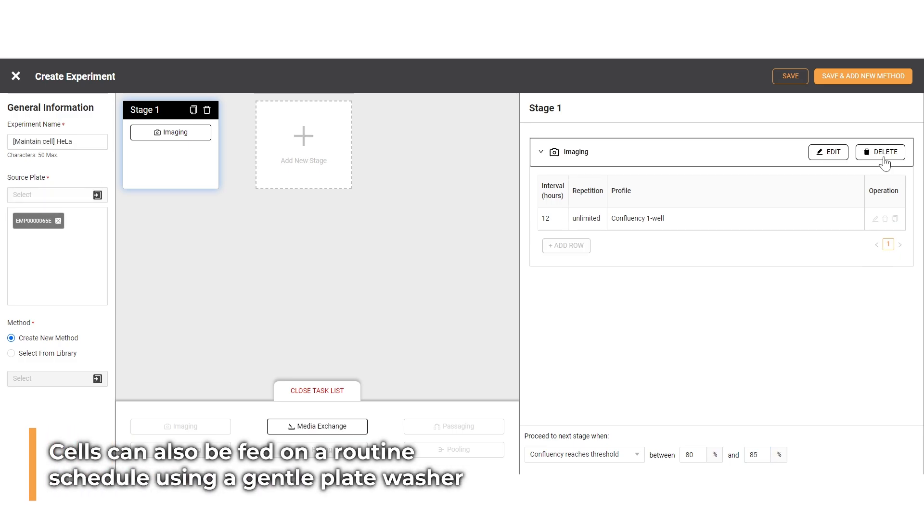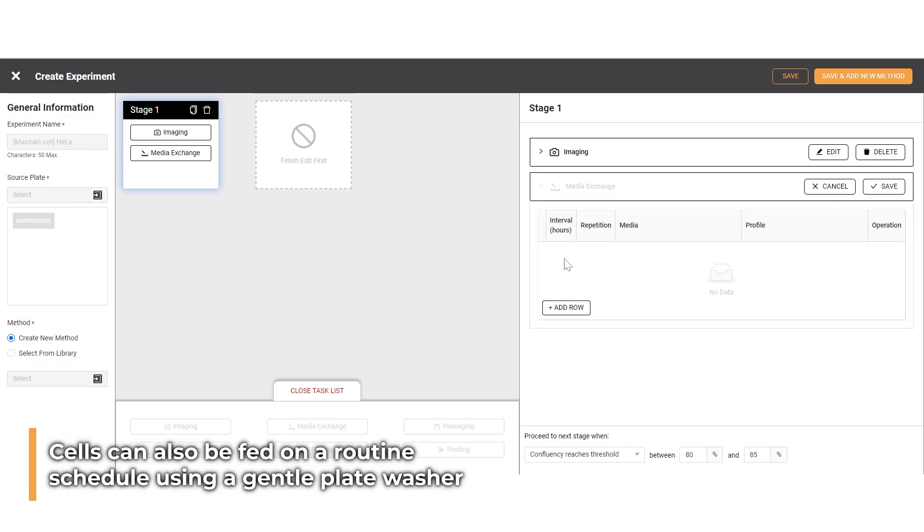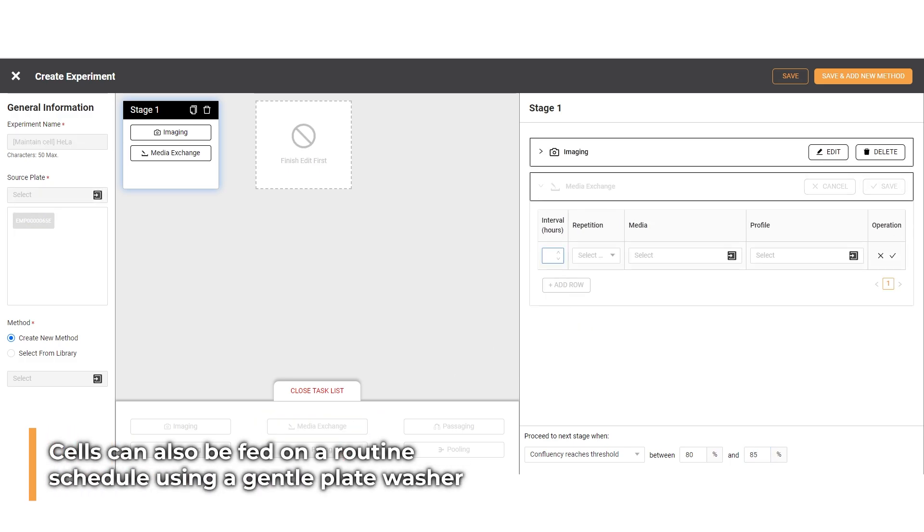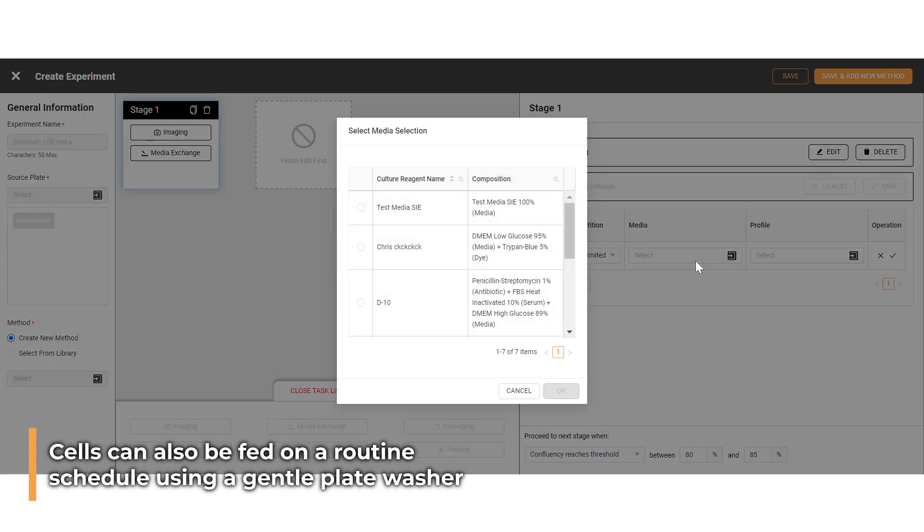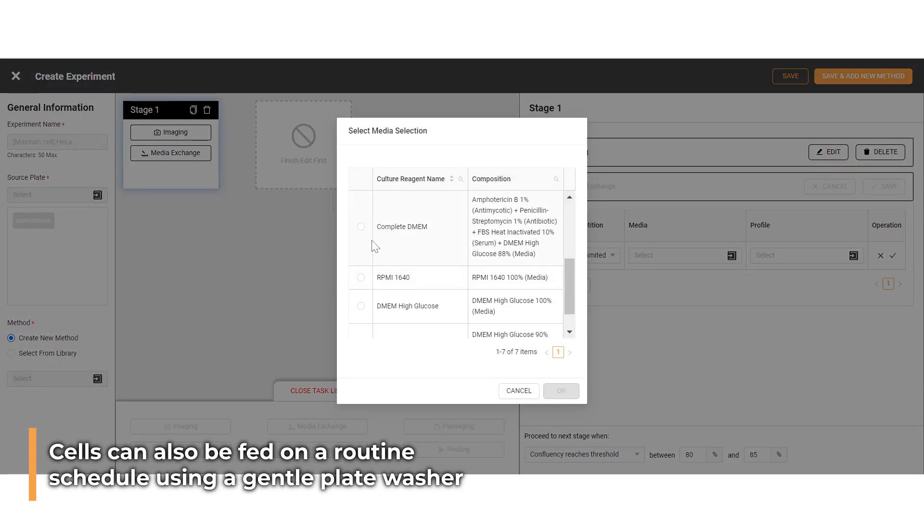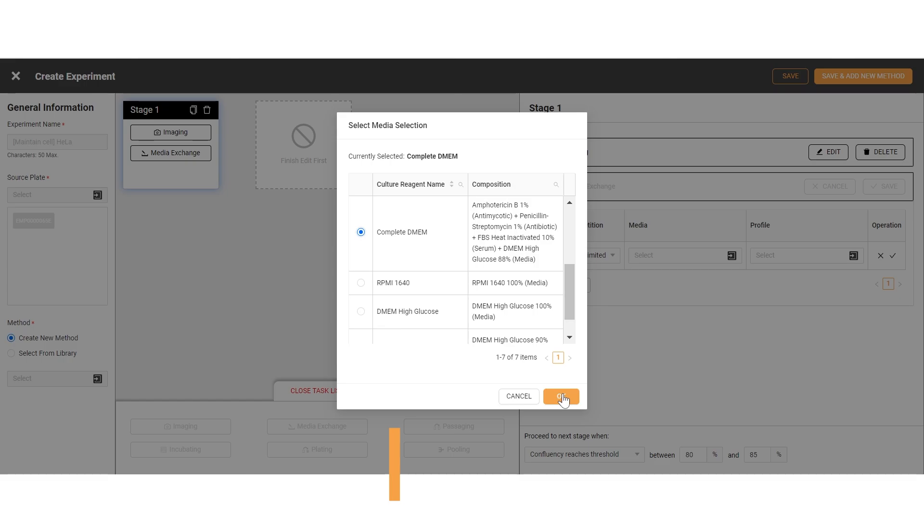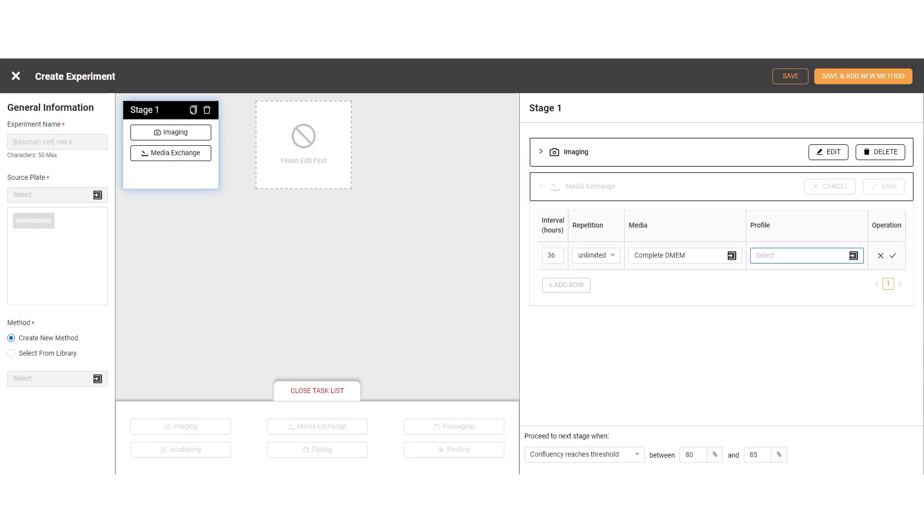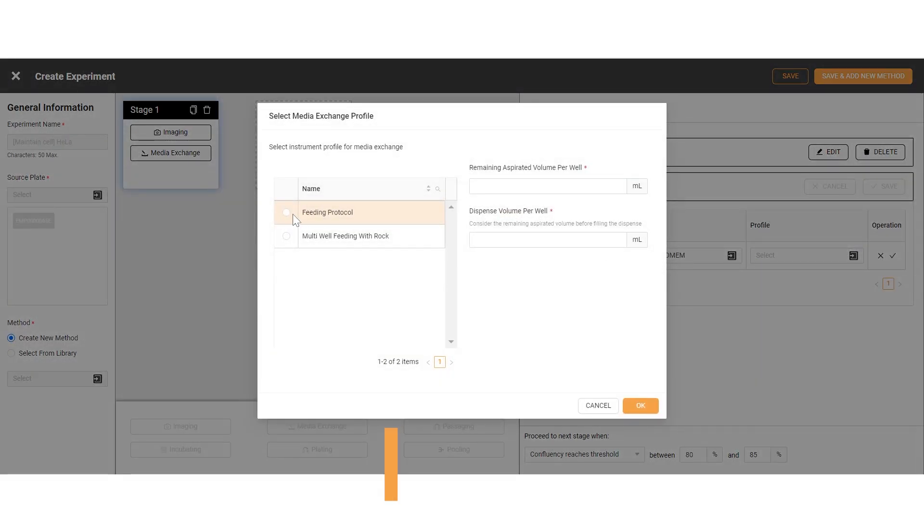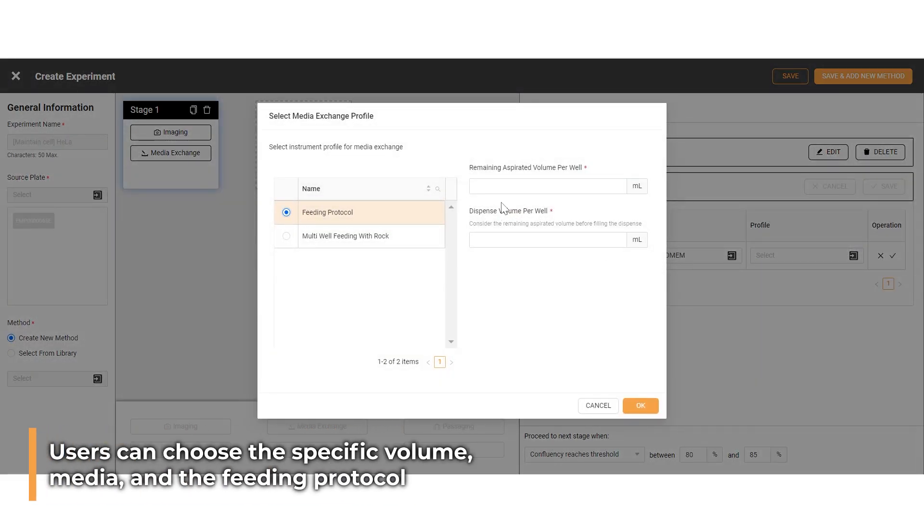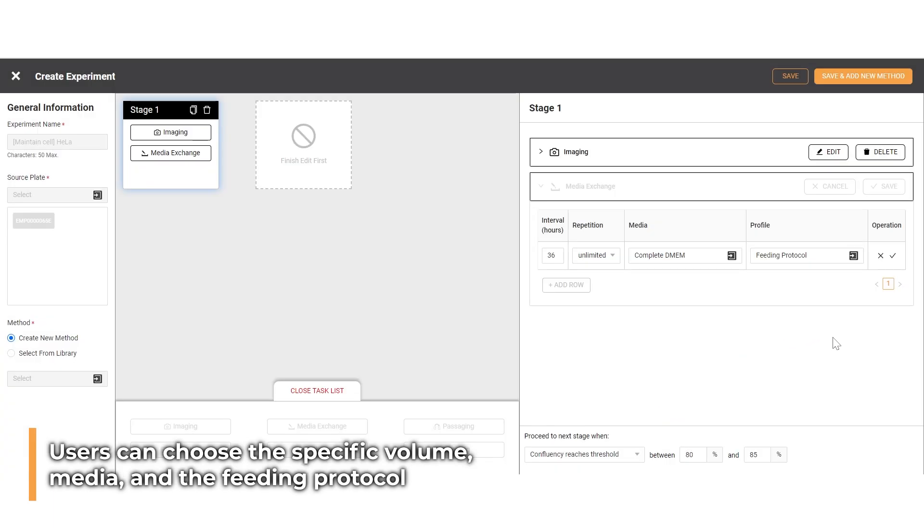The imaging task can also be executed together with the media exchange stage, which replaces the old media with fresh media to maintain the health and viability of the cultured cells. Users can choose the specific volume, media, and the feeding protocol.